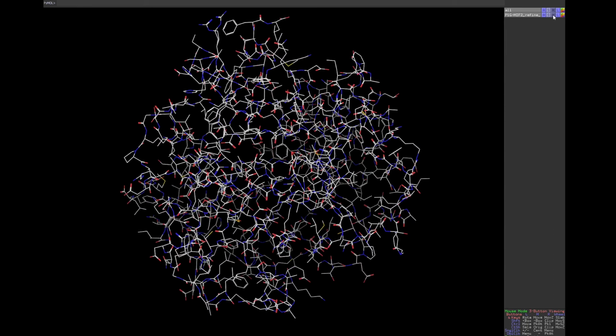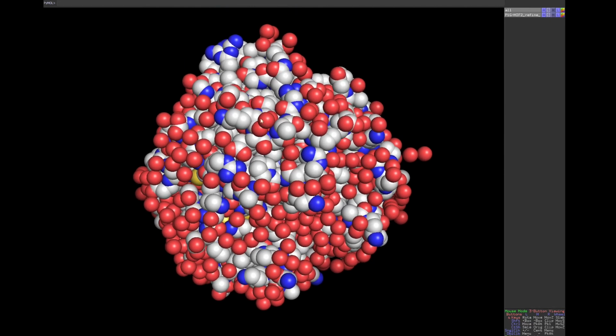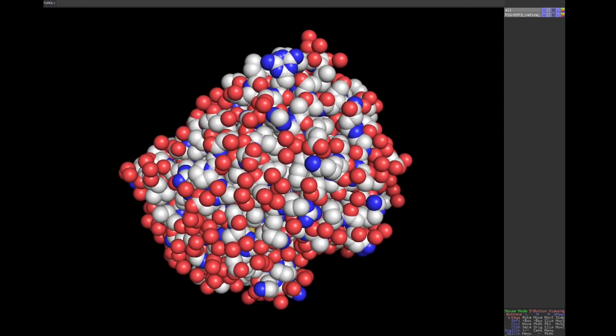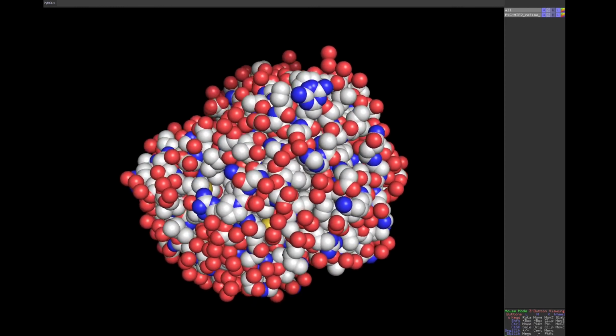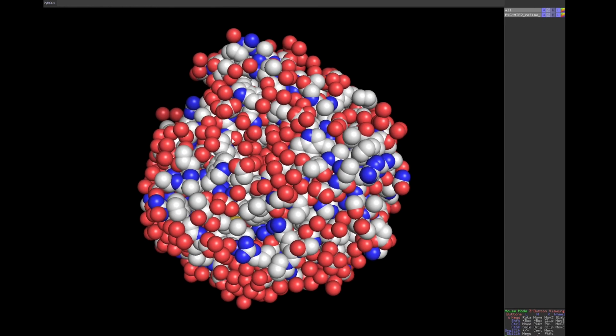Finally, I can put away the chemical structures and simply show the position of each atom by a sphere. These are the positions of every atom in the protein. This program called PyMol knows where to draw each of these atoms in space based on the chemical structure of the protein, and each atom has a particular XYZ coordinate which was experimentally determined by X-ray crystallography by measuring the electron density to identify where those atoms would be.